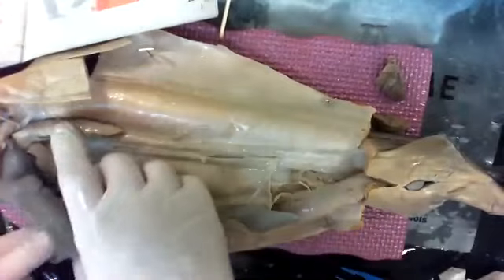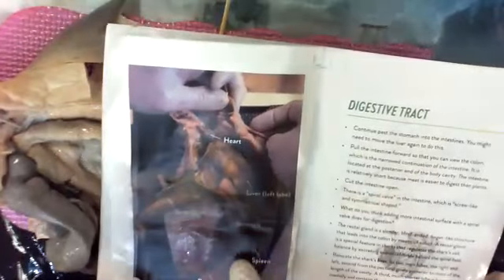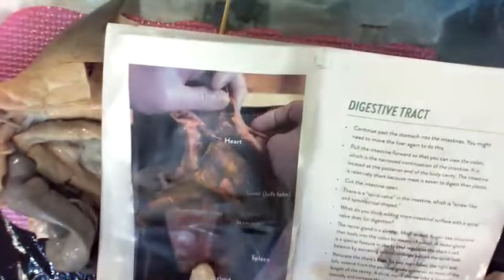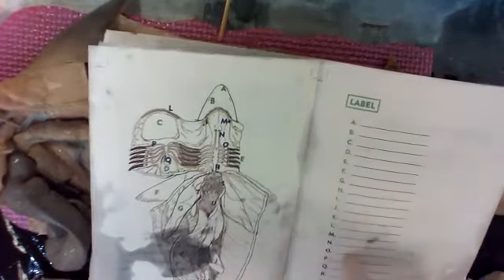So those are all the internal organs. Add them all. Here you can see again, heart in the chest. Here are the liver, lobes, stomach, intestine, rectal gland. Here you can go and fill these in, just for your fun. But like, there's the rostrum. So the nose is rostral. And there's, you can plug those in. The green ones are easy easies.